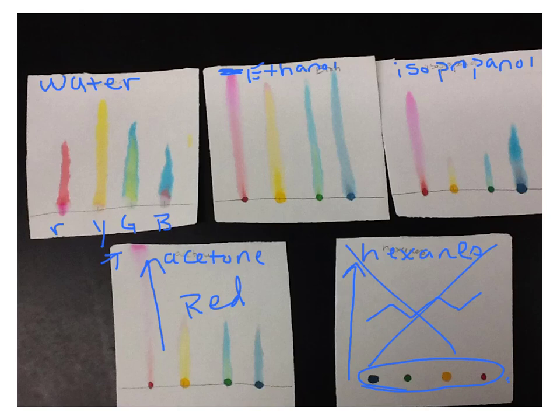Okay, and if we look over here, we look at the difference between your isopropanol and your ethanol. A lot of you can see that the blues and the yellow separated fairly well. If I was to choose which would have been the best solvent to see separation, I would probably go with ethanol. It looks like we got a little bit, because you can see that the green separated into a little bit of blue here and some of the green here, okay? You got red out of your yellow there. So I would say your best solvent for separation was your ethanol, because ethanol had properties of both, okay?